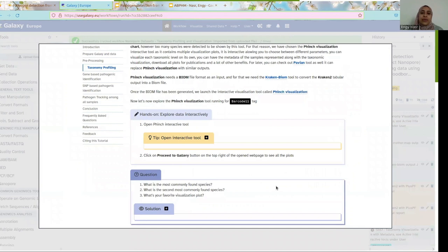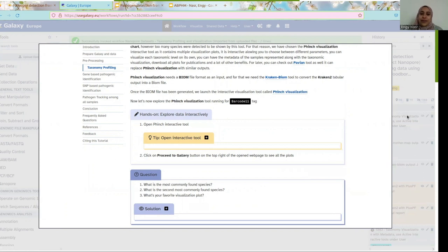Finch visualization tool takes a BIOM file. Part of this workflow is to take the Kraken 2 output — which is mainly tabular — and convert it into BIOM files to be read by Finch. To do so, we installed another tool in Galaxy called KrakenBiom, which converts the output and also takes the metadata file into Finch visualization tool. So what you did now is run the workflow. For me, I will go directly to the output to see the Finch visualization tool, but I will switch quickly to Chrome and come back.